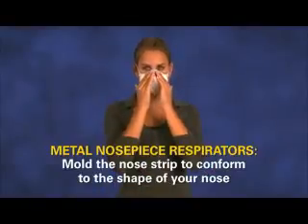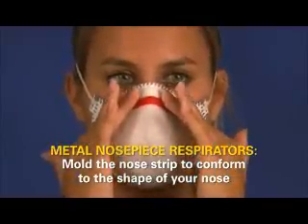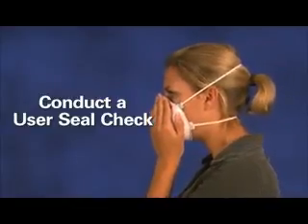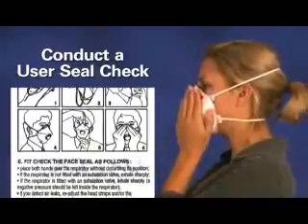If the respirator has a metal nose piece or strip, use both hands to mold the nose strip to conform to the shape of your nose by pushing inward while moving your fingertips down along both sides of the nose piece. Next, conduct a user seal check. It's essential to follow the manufacturer's user seal check instructions because the manufacturer knows the best method for checking their respirator. Generally speaking, the manufacturer's instructions are based on covering the surface of the respirator, usually with your hands, so that air is prevented from passing through the filtering facepiece.